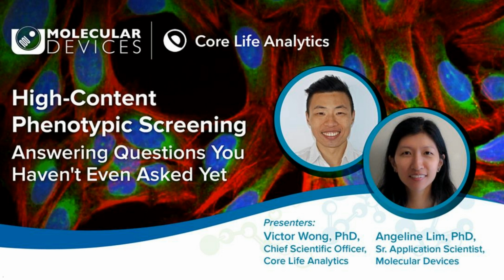Next to that, Victor has been working on a manual that is integrated in the software in the next version. So for the step where you are at that moment, let's say the QC part, you can pick your brain in the manual and see exactly what you can do there and how you should do that.